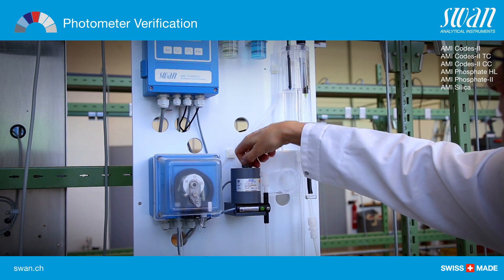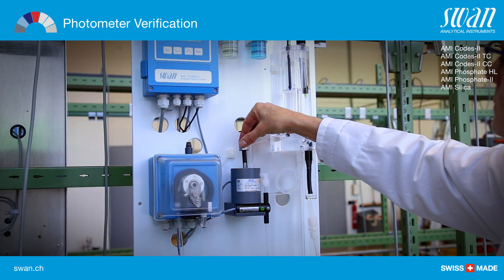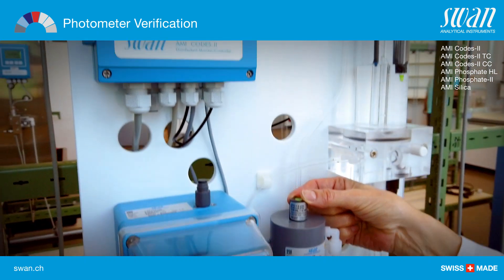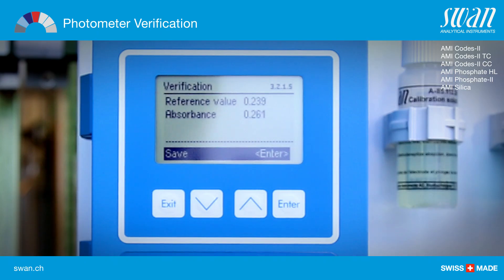Open the cuvette by screwing off the cover and insert the verification kit. Align the triangle shape either to the front or back side and adjust for minimal absorbance while observing the value on the display.